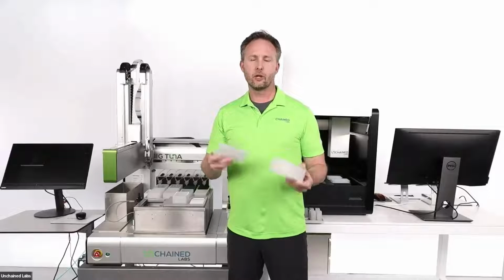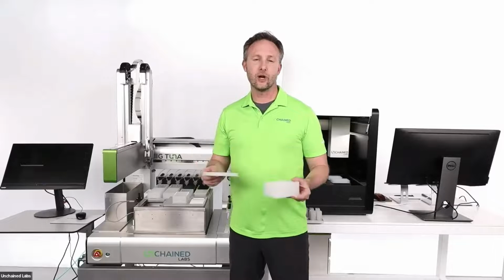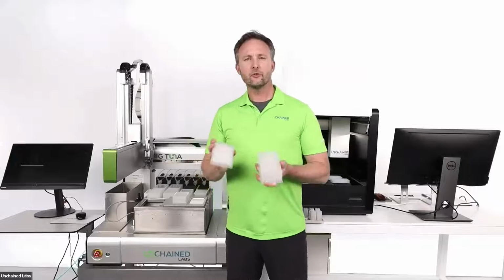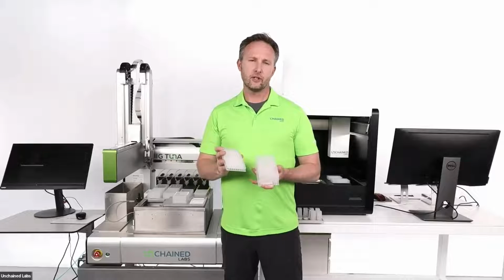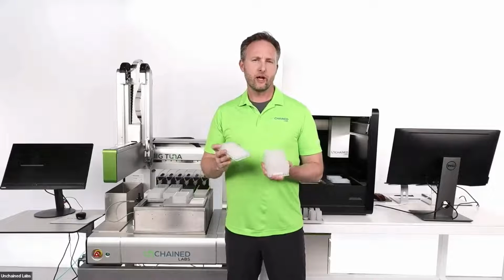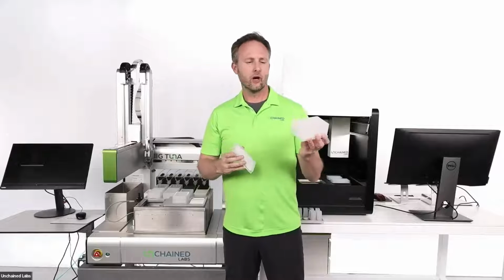They come in various molecular weight cutoffs, starting at 3 to 10, 30, and then 100. And it comes in two different volume and format sizes. And spoiler alert, that's really the primary difference between Unagi and Big Tuna: the capacity of your samples. Sample capacity can be thought of in a few different ways. It could be your number of samples, so 96 here, or the volume of your samples.